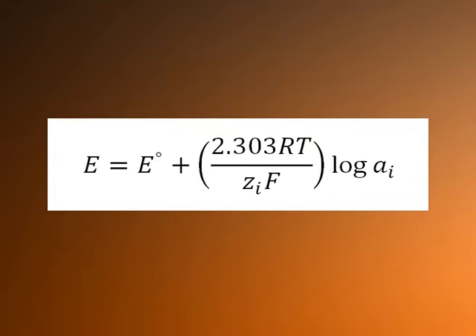For direct potentiometric measurements, the experimental setup requires an ion selective electrode, a reference electrode and a potential measurement device, which can be a pH meter or a multi-voltmeter. The ion selective electrode is nothing but an indicator electrode which is capable of selectively measuring the activity or concentration of a particular ionic species present in the analyte.